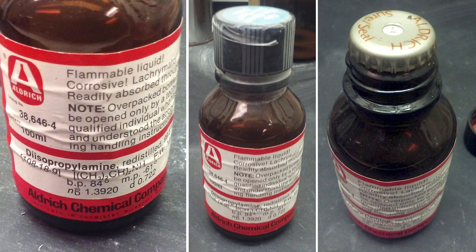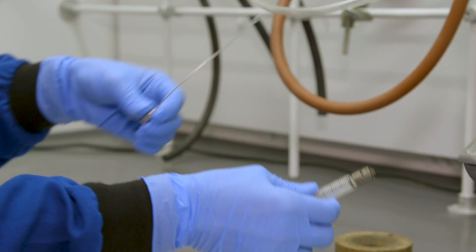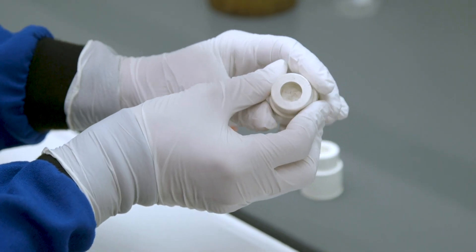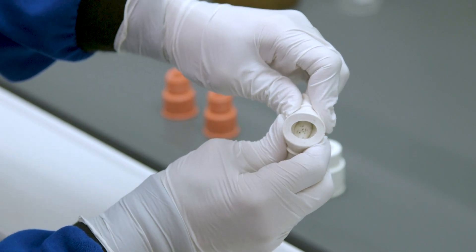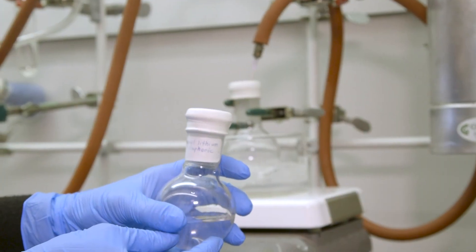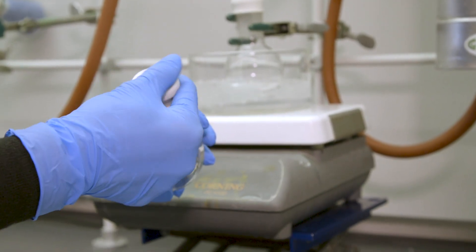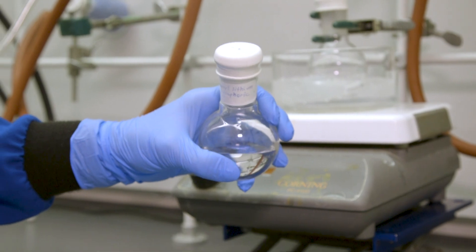The organolithium reagent can be accessed by puncturing the Teflon seal located under the cap of the SureSeal bottle. The needle used for a syringe transfer should be no larger than 16 gauge and be long enough to easily reach into the reagent while the syringe is being held upright. Before and after use, inspect the septum for any damage or elasticity loss. If degradation is determined, the reagent should be disposed of as hazardous waste. A failure of the septum can result in a fire. To prolong the lifetime of the seal, avoid puncturing the seal in a previous puncture location. Instead, penetrate the seal from the side in a region that has not been previously punctured.